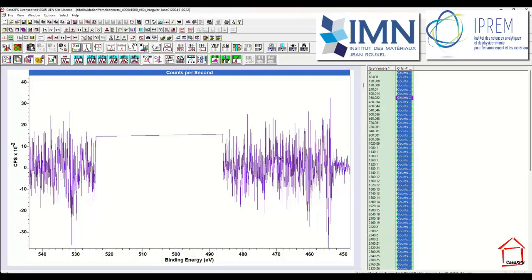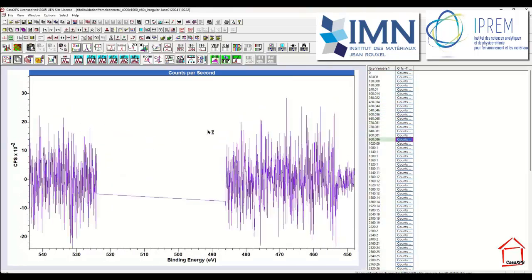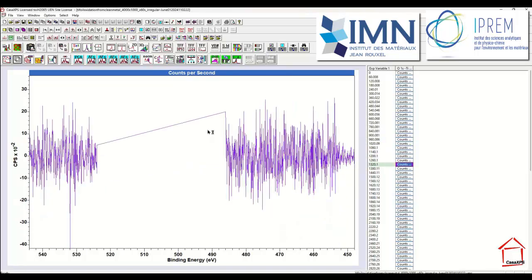We don't need this abstract factor to reproduce the data. All we would be doing if we included this abstract factor into the calculation would be to add back noise. So the idea is to avoid adding the noise that is actually within all of the rest of these abstract factors.